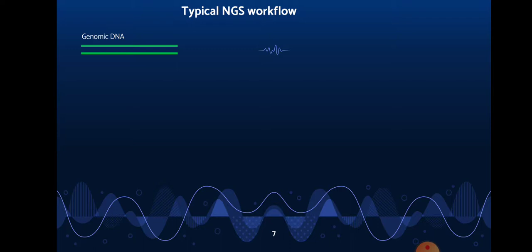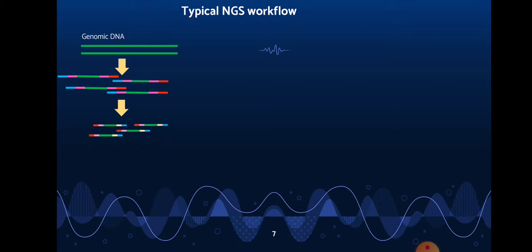Once we have a DNA sample, we will fragment it by using some endonuclease. This part is very important as sequencing platforms need small bits of DNA to sequence. The fragmented DNA will be attached with predefined primers and barcodes. Here the red colored and blue colored bars are primers and the pink colored ones are barcodes. Barcodes are specialized DNA fragments which are needed to identify the fragments after sequencing by the system software, which helps it to arrange them in a proper manner. Once this step is over, we will get some fragments which will appear like this in a solution, and this solution is called a library.